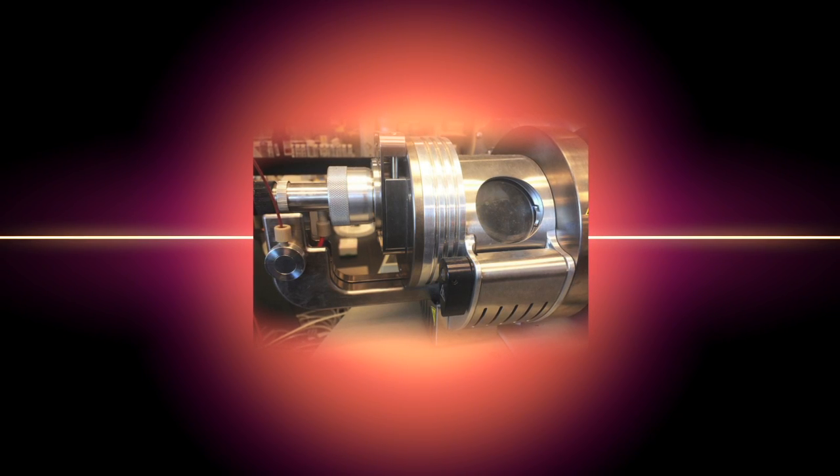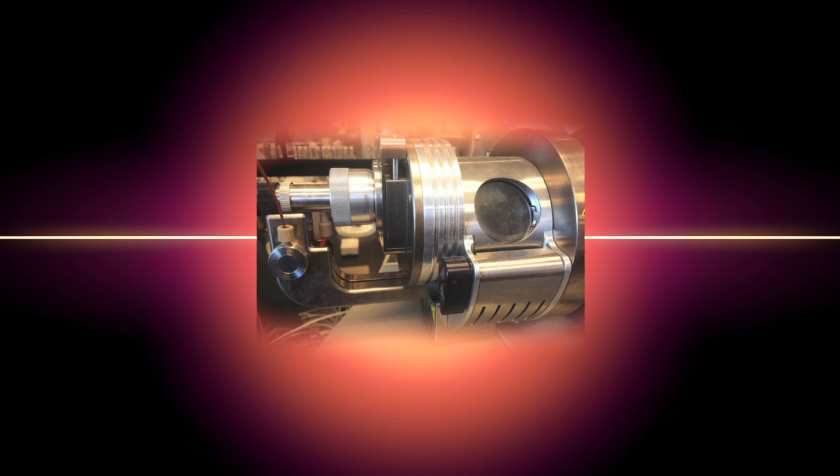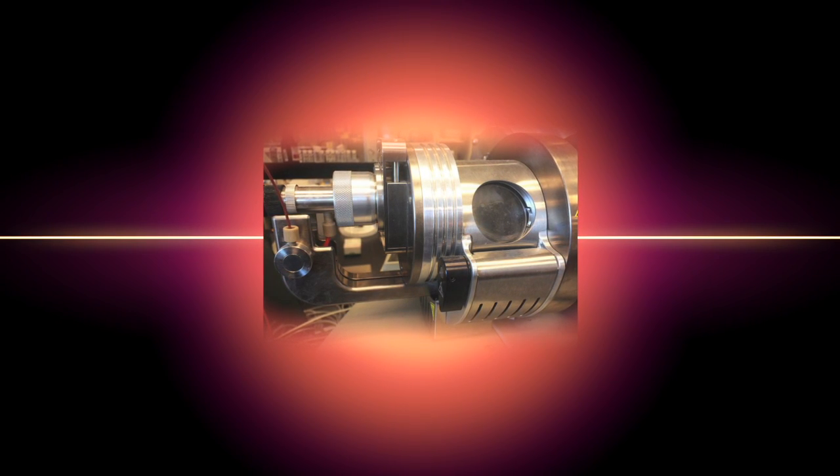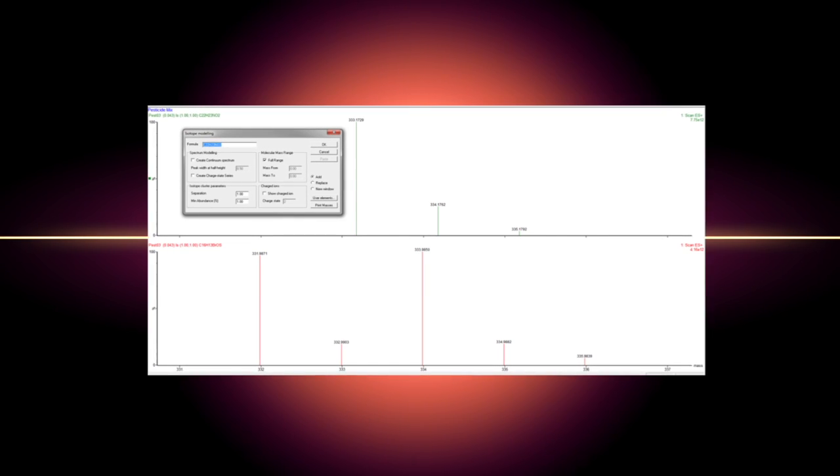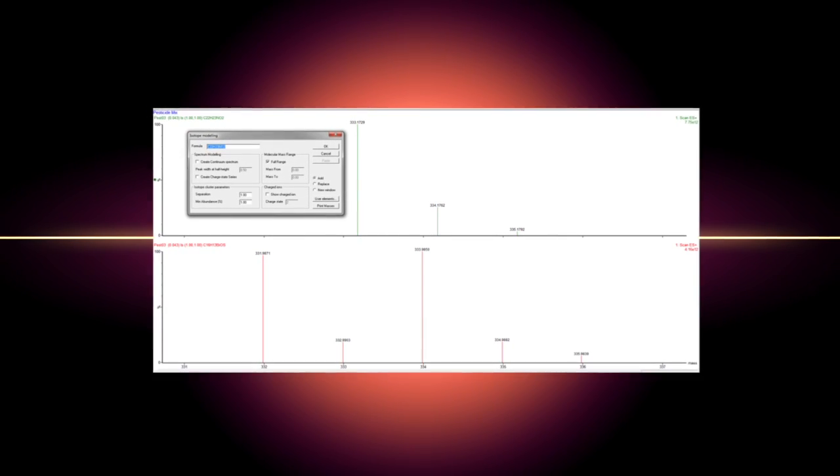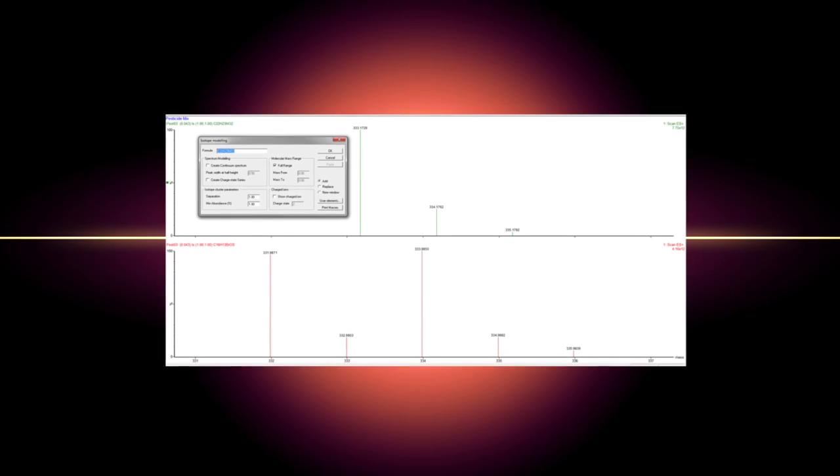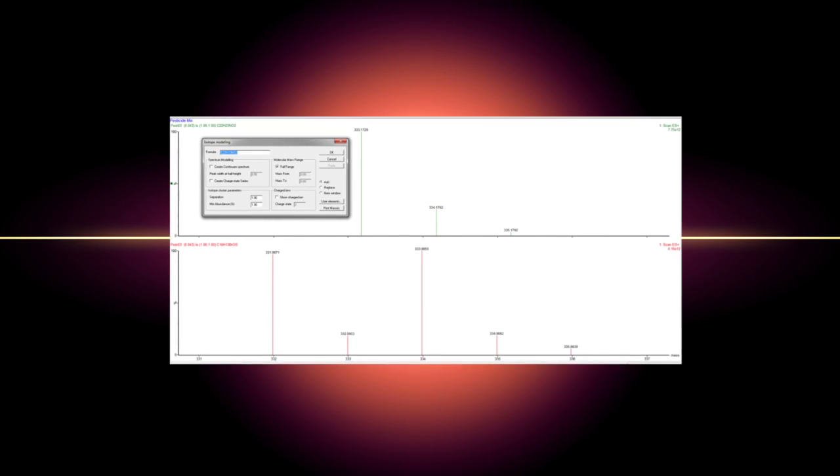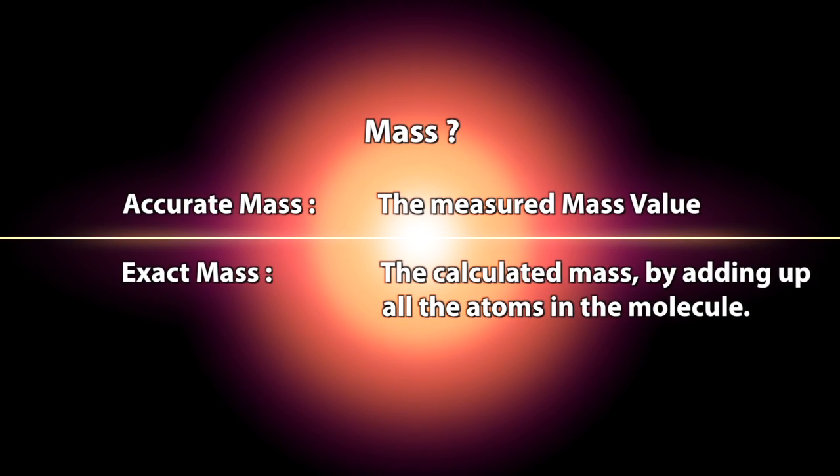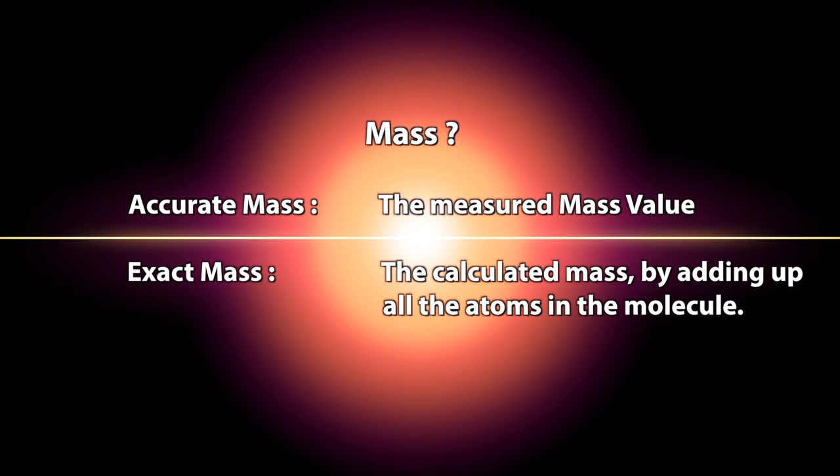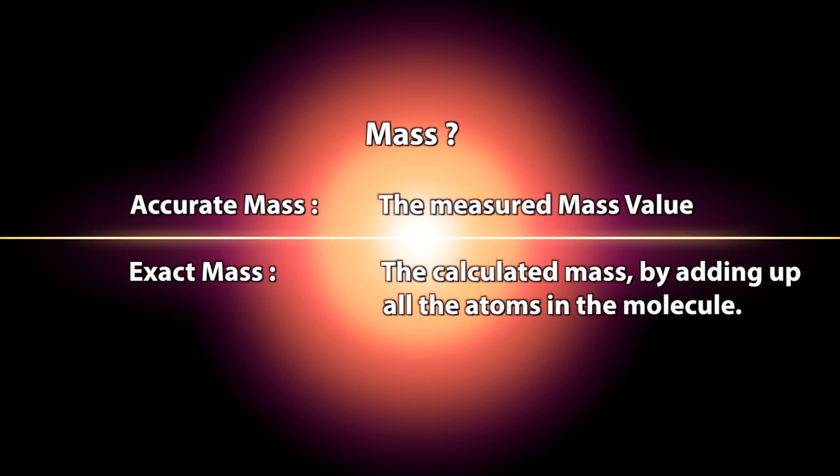This particular instrument has a quadrupole followed by a time-of-flight mass filter. Using a calibrant and the lock mass feature in the software, we can also acquire high-resolution data on the molecular ion and confirm the probability of a particular formula according to a comparison between the exact mass calculated and the accurate mass recorded by the instrument. Results have to be within 10 parts per million for publishing purposes.